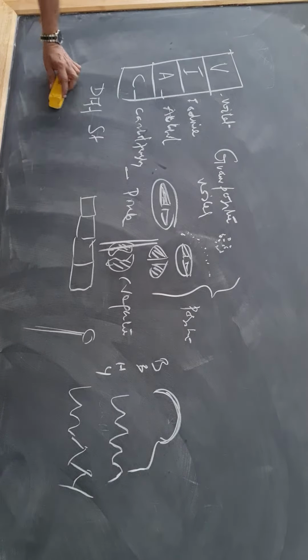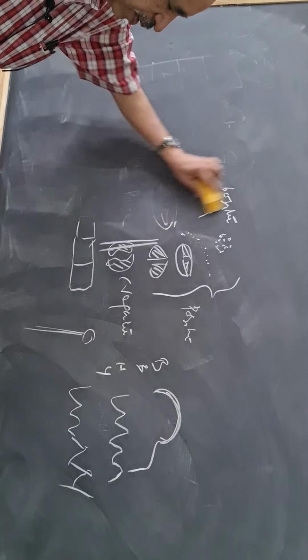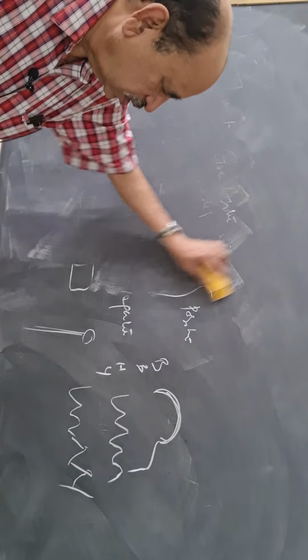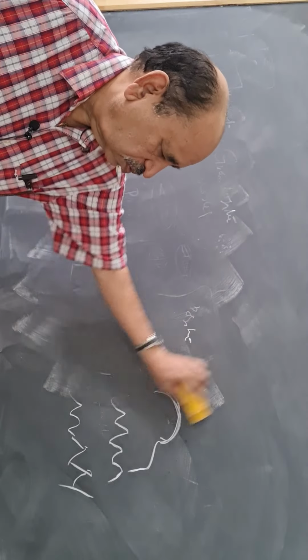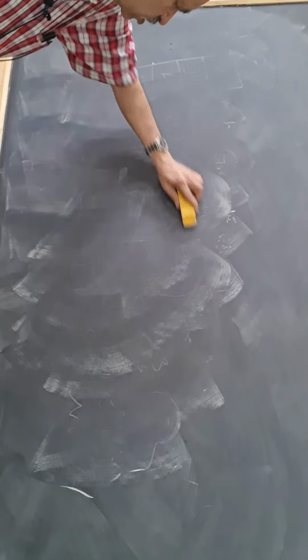So please remember, this will be one of your final year practical exercises, and we'll ask it in internal assessment also. It's very important to know about this. Today's topic is Ziehl-Neelsen staining.